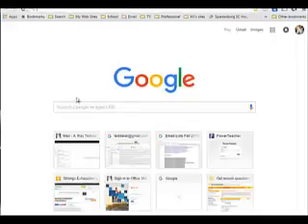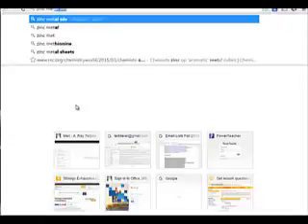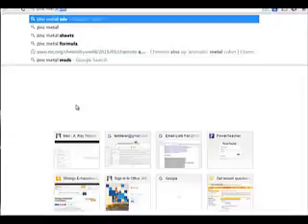All right, so let's type in our first metal, which was zinc, and let's just call it zinc metal. Now, where you're going to find this stuff is in what is known as an SDS. SDS, you need to know what those letters stand for. It stands for safety data sheet. Now, if you ever have trouble finding a safety data sheet for a chemical, you can simply look it up as MSDS. Up until two years ago, it was called a material safety data sheet, but now it's just called a safety data sheet. So you can plug in just zinc metal and SDS.